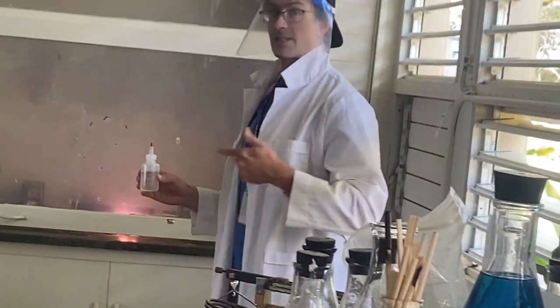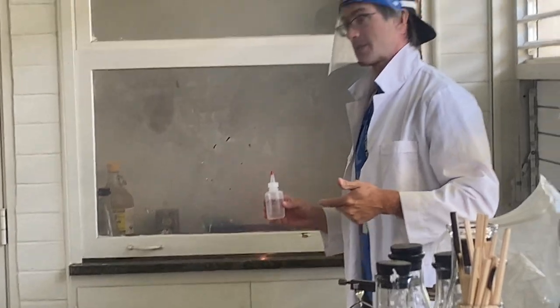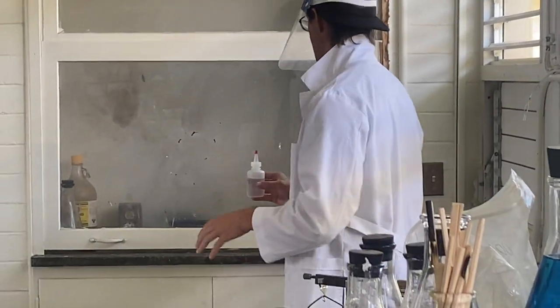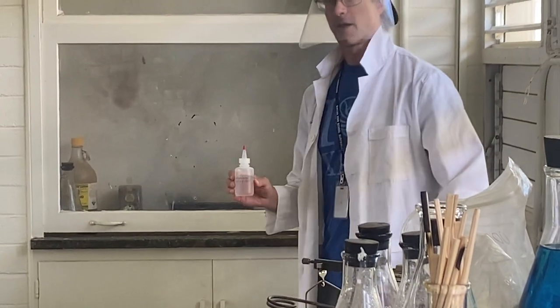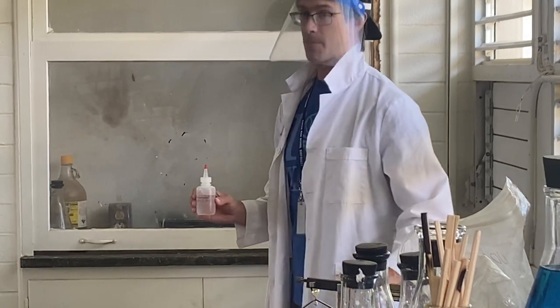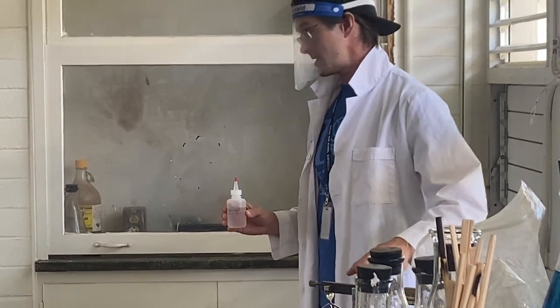When we did this as our demonstration, our lab coordinator told us that if we did it right, we'd break the beaker. I broke the evaporating dish — it's like a step stronger than a beaker for heat.